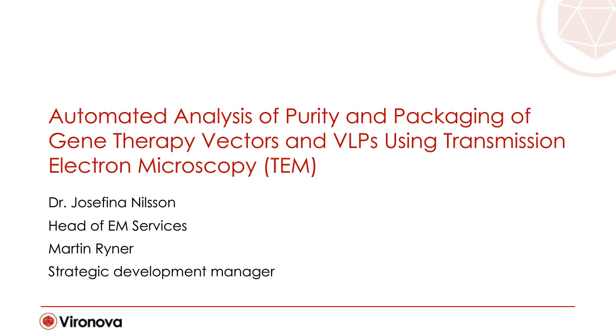Thank you very much, Rita, for the introduction. So today, Martin and I will talk about automated analysis of purity and packaging of gene therapy vectors and VLPs using transmission electron microscopy. However, this approach can of course also be used for other nanoparticles.